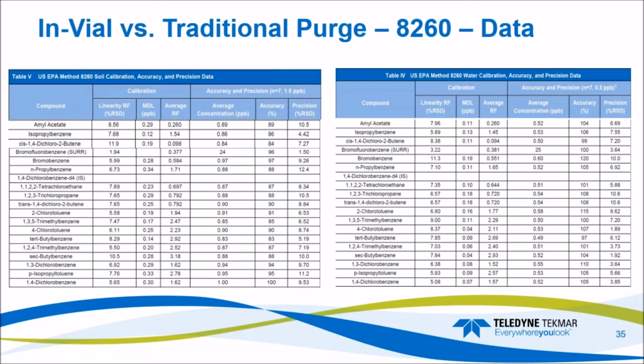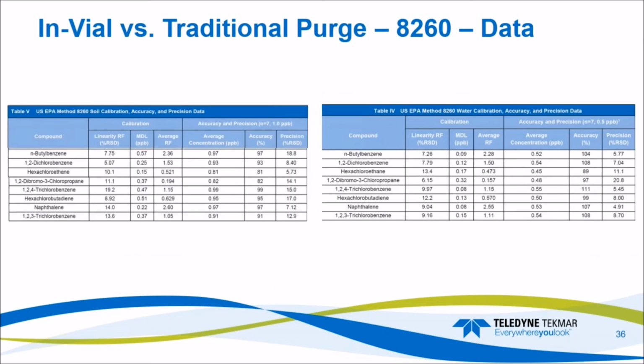Further look into some heavier compounds, still recovering great with our MDLs looking good and our RSDs passing. And our heaviest compounds there at the end.